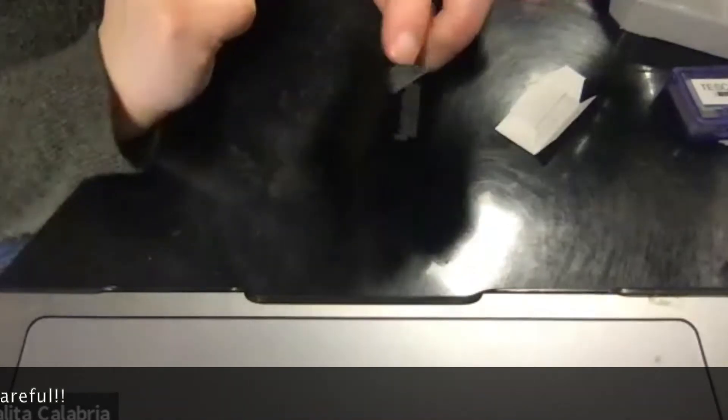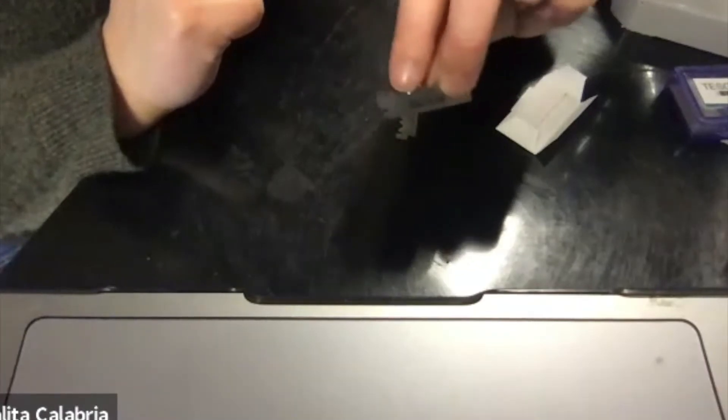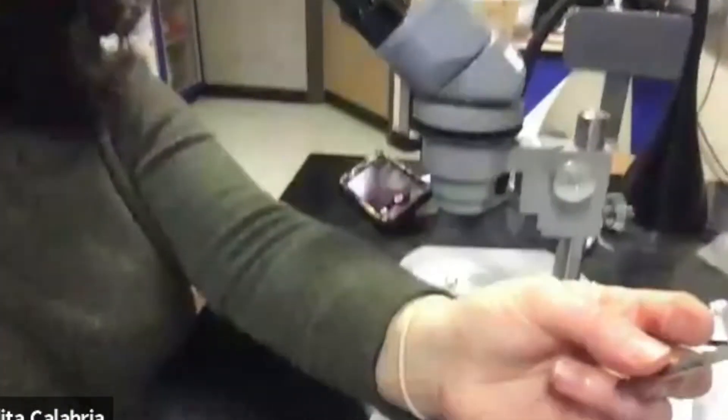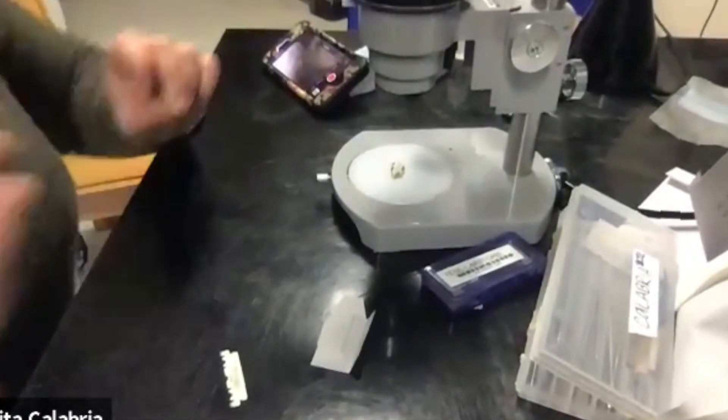So now you can use it like a knife, and we're going to be cutting and making sections of the apothecia like this. Okay, so we have our razor, we have our microscope here with our apothecia. Let's get started.